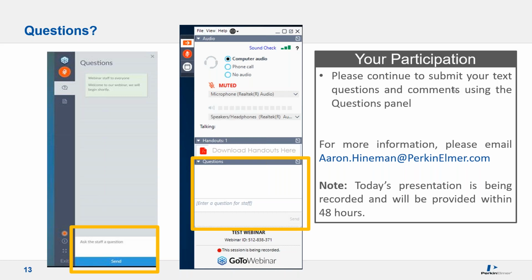So this is a good question too. Our lab performs oil analysis. I guess it doesn't really matter what type of analysis. Our calibrations have 23 elements. In order to perform MSF, do we need to use single element standards for each element of interest, and each interfering analyte? When you say you're analyzing for 23 elements, all 23 of those elements are not going to have spectral interferences, but you will need them for each one that does.